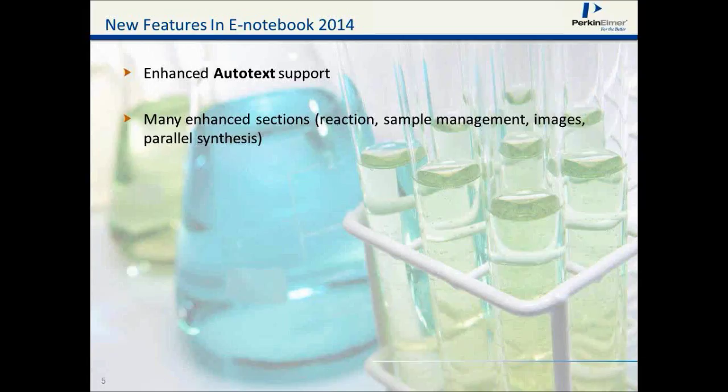So if you have a reaction section, the continuous reading mode is not supported at this moment, but for Word experiment, Word sections and PowerPoint sections, we will be able to have a different type to go through all the information.